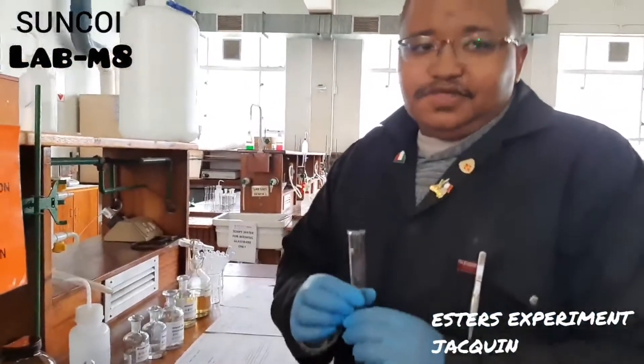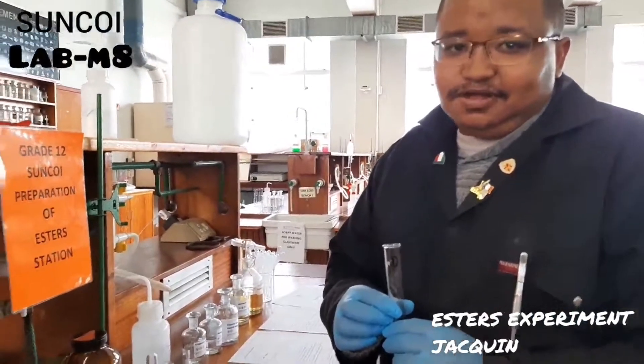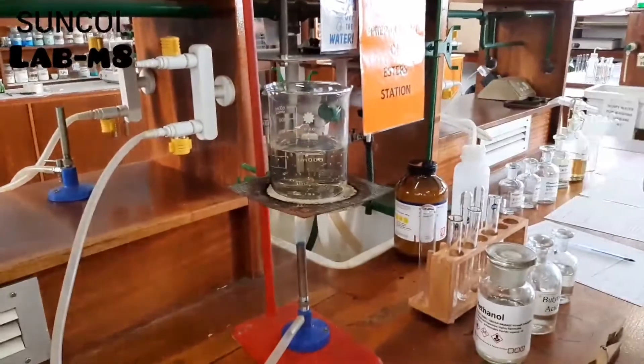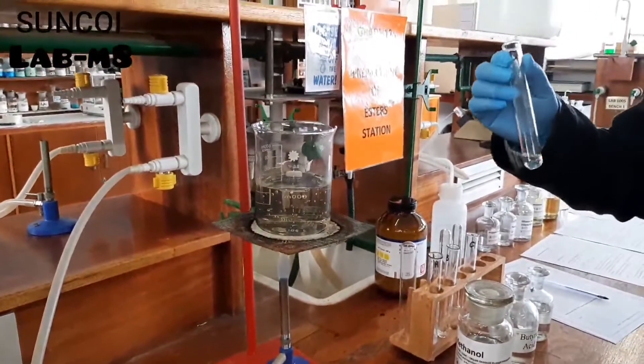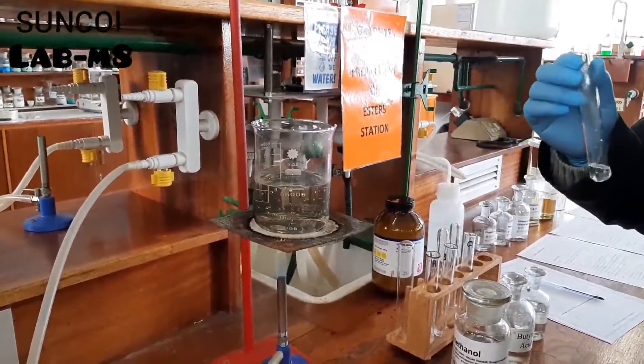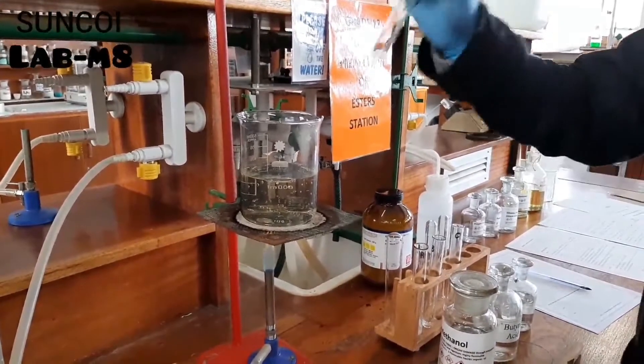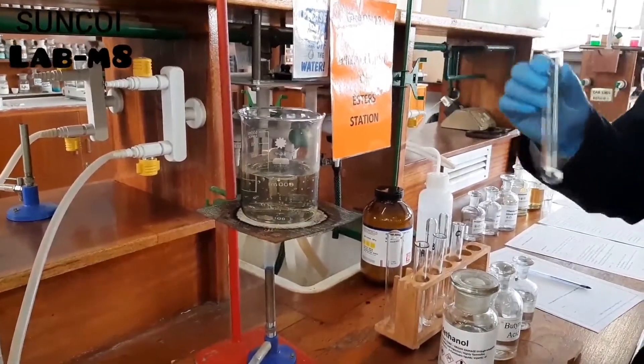With this reaction you don't need the reflux setup. All you need is a flame, a water bath, a test tube with a small amount of reagents. You heat them up for three minutes and it's done.